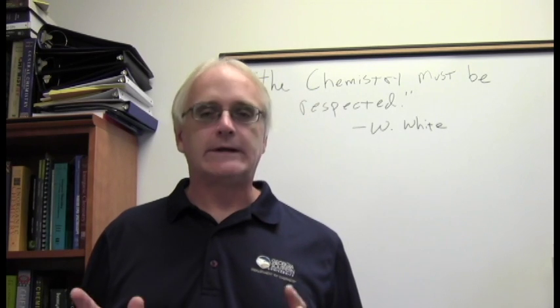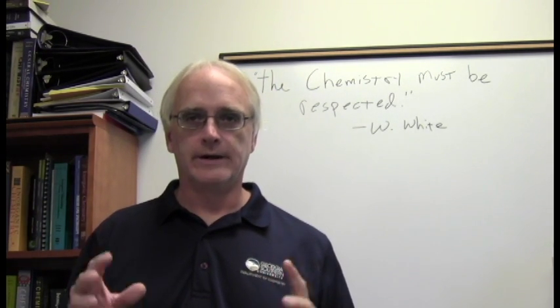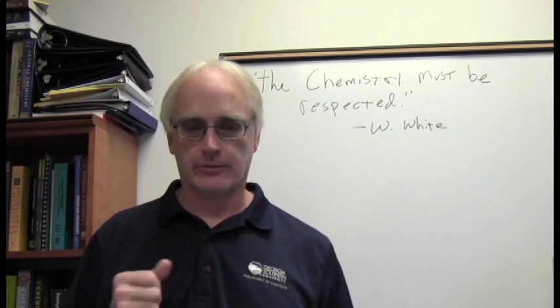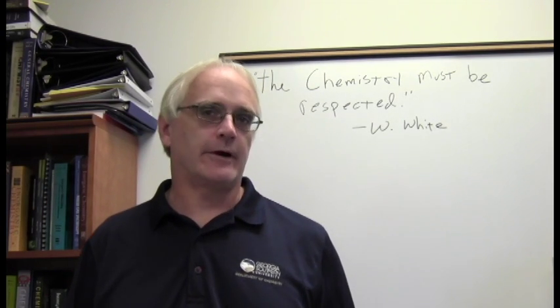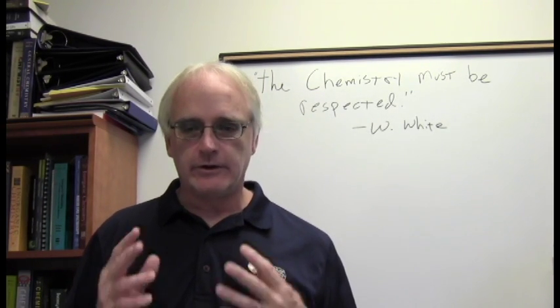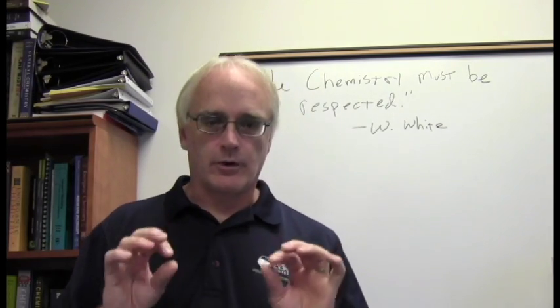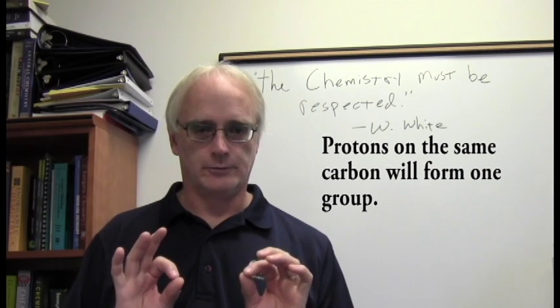We begin with one key idea. Protons on the same carbon will form one distinct group, whether it's one proton, two protons, or three protons on a carbon. There are exceptions, and we will consider them carefully later, but for now, treasure this notion, hold it in your heart, and don't let it go. Protons on the same carbon will form one group.